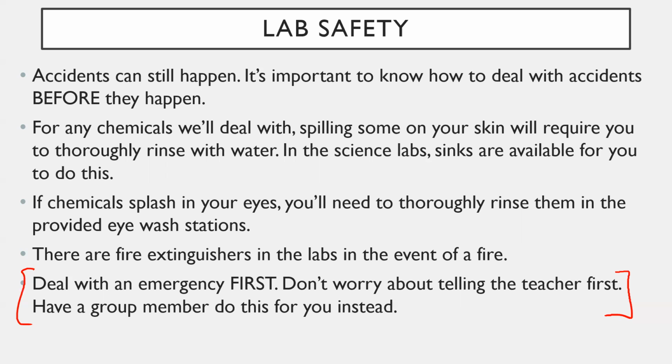Believe me, as you guys are doing the lab, I will be supervising the whole time. If I see someone run towards the sink and start washing their hand, or if they head to the eye wash station and start rinsing out their eyes, I will know something just happened, right? So you don't have to worry about coming to tell me you got something on your eyes or your skin. I will know.